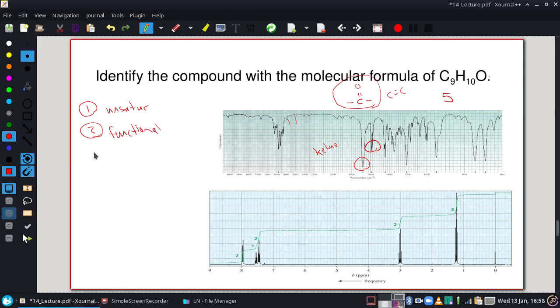So when we get to the proton NMR, we want to assign every peak. But we're going to do this a little bit different. Let's start by looking in our NMR for something that actually explains those elements of unsaturation. Especially when you have a lot like this one, because I would like to explain the other 4, and I can right there.